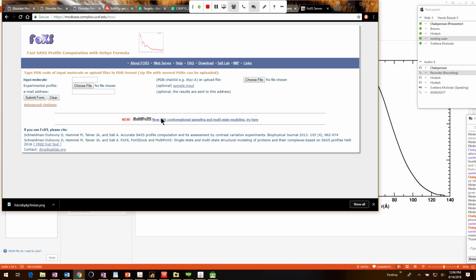Again, for us, we're doing this high throughput thing. So that allows you to screen salts and pHs to see which one stabilizes which the best. So that's what we'd use it for. SEC-SAXS is available almost at every beamline nowadays. We are shutting down at the end of the month, but there are other beamlines out there that you could run in that month if you can arrange it. But we'll be back in August.